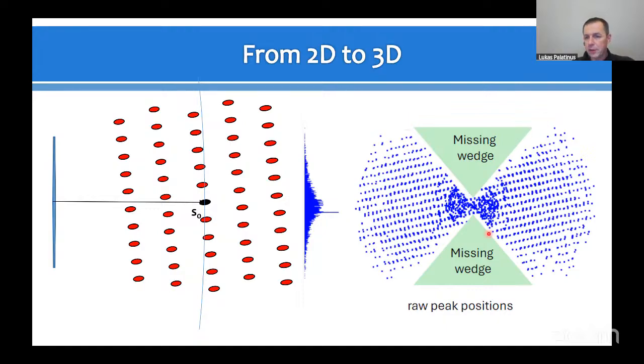It's quite clear that from such a cloud of points, it's relatively straightforward to find the unit cell of the reciprocal space that describes such set of points. This can be done either automatically by indexing algorithms or even manually, just by rotating this cloud and indicating what are the special directions in reciprocal space.